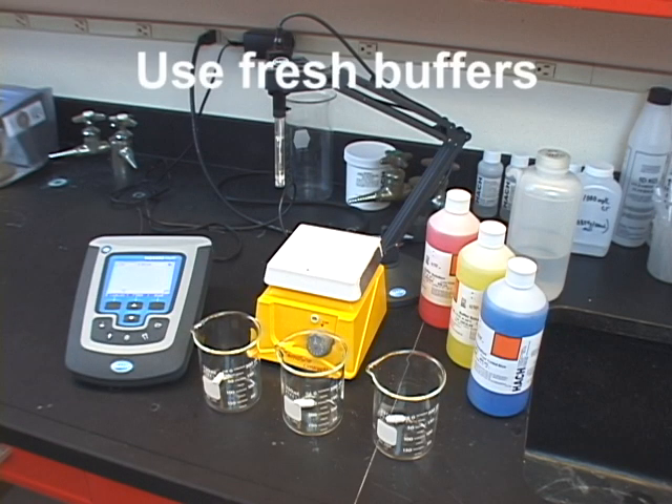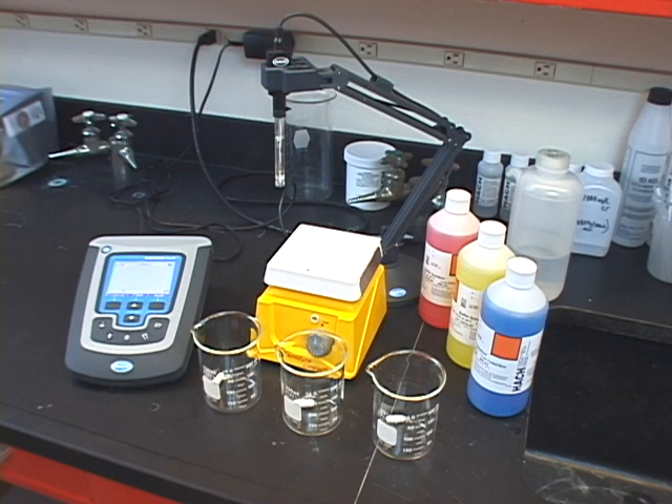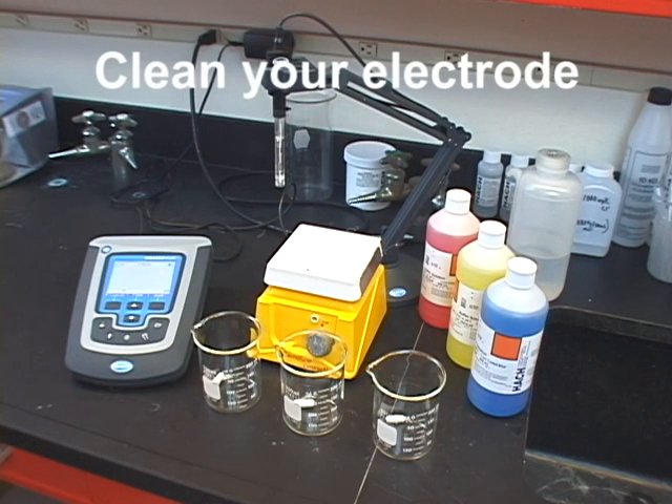Also remember, you want to be sure to use fresh buffers every time. Reusing buffers may cause your meter to calibrate incorrectly, resulting in inaccurate measurements. It is also critical to clean your electrode before calibrating, so there's no contamination.